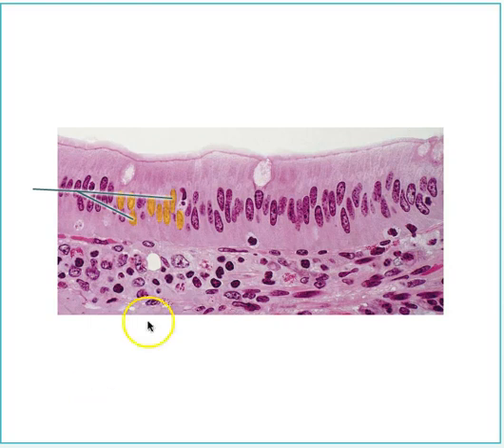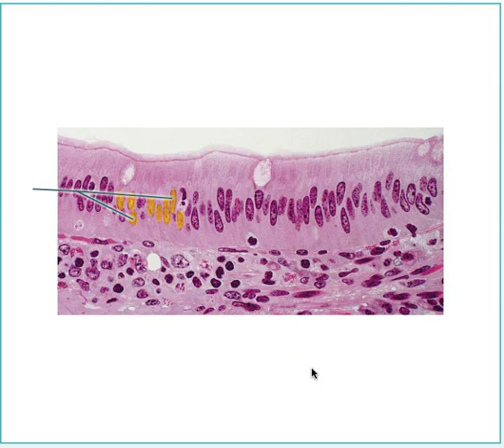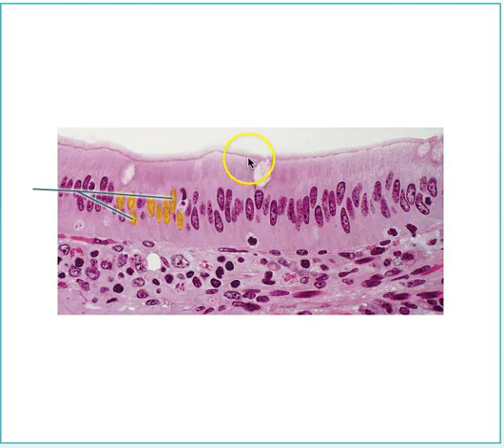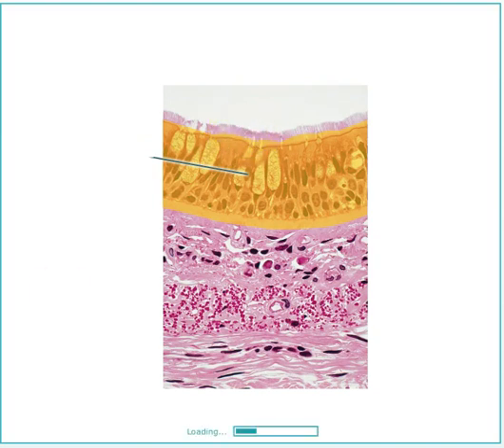Let's identify the tissue type, the highlighted structure, and also what this pink fuzzy stuff is at the top. Looking at elongated nuclei, tall cells in this tissue, cells seeming to be pretty much the same height, with a goblet cell here. The yellow highlights are the nuclei. This is the basement membrane, so this has to be the apical side. Because the cells are the same height, I'm going to say this is columnar. And this pink fuzz on the apical side looks nothing like cilia, so I'm going to say this is microvilli. This is simple columnar epithelium.